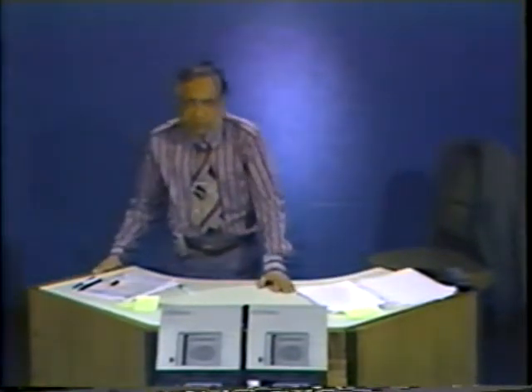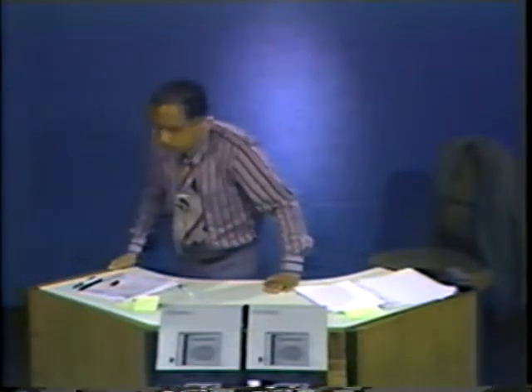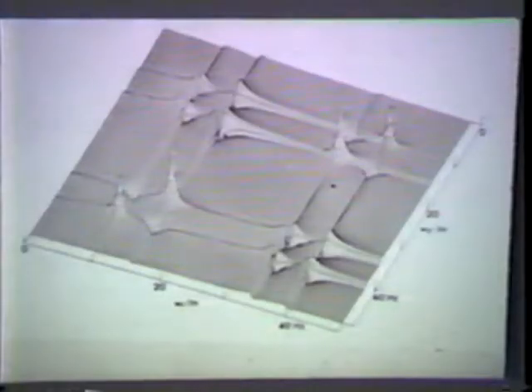For a two-spin system, one can see the result, and I have these results in slides. The first slide shows you, may I have the first slide, please? Yeah. Is that okay? It is showing us the calculated spectrum of two spins A and X coupled to each other. This is the diagonal part, which in this particular pulse scheme is dispersive, and this is also diagonal, and these are the cross peaks, which are absorptive and antiphase. These ones are going down, and these two are up.